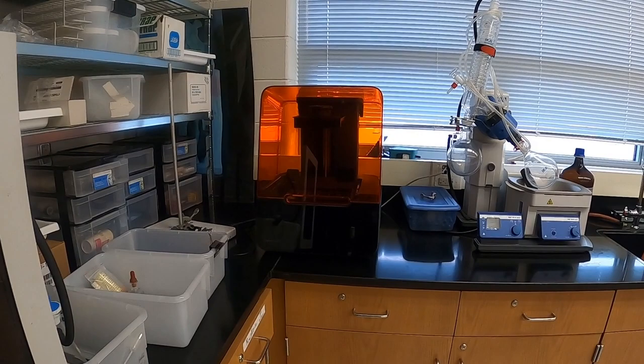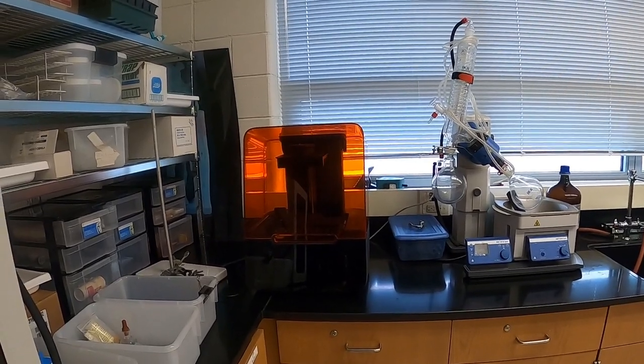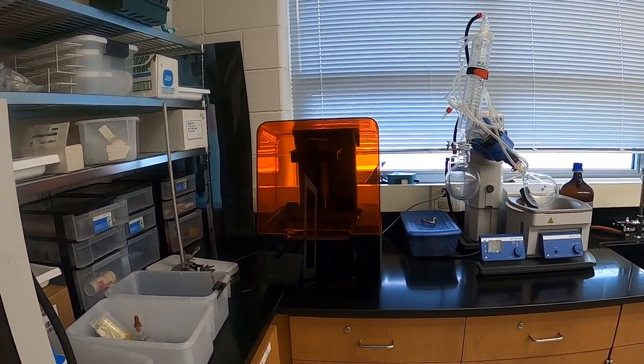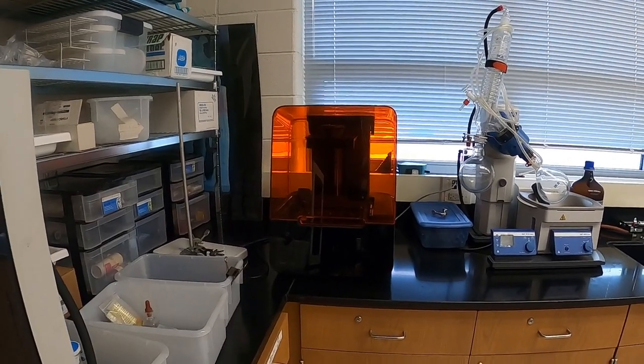Some other applications I'll talk about later include the 3D printing of microfluidic devices for miniature reaction chambers. And on the right there, we have what's called a rotovap for doing distillation of organic solvents from products.